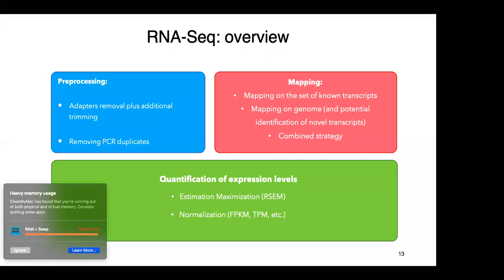The workflows utilize certain file formats that are structured data in a stepwise manner. The file formats are taken care of in a pipeline, where you are fixing errors in the reads, cleaning up unwanted technical variations in the pre-processing stage, then mapping onto the genome or transcriptome, and after that structuring the raw reads into gene and isoform.